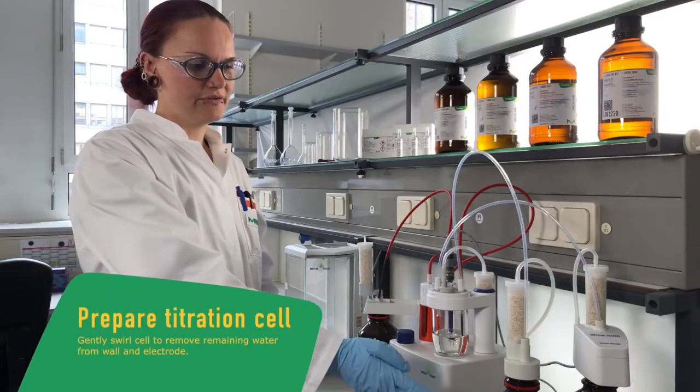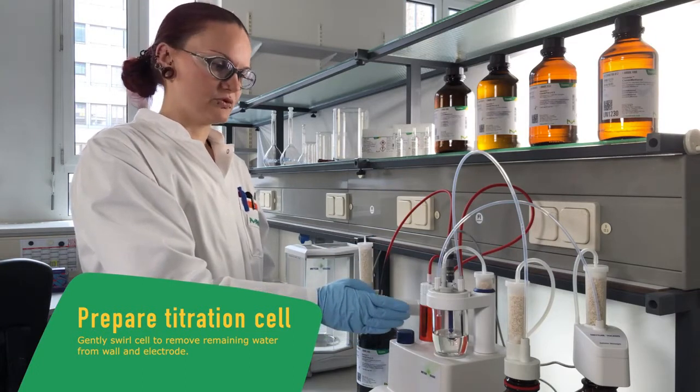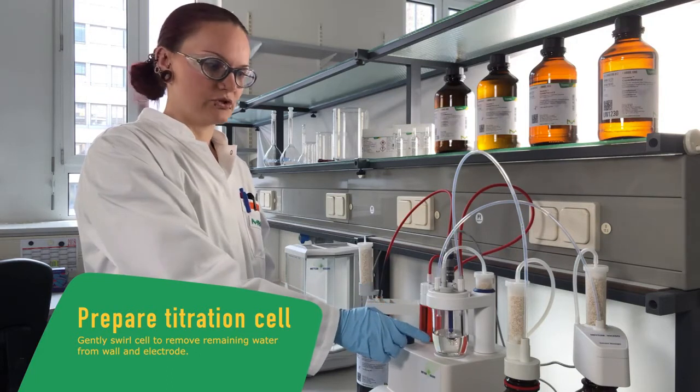When the fresh solvent is added into our titration cell, we gently have to swing it to bring down the water from the walls or the electrode into the solution.